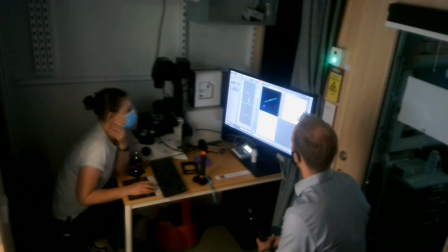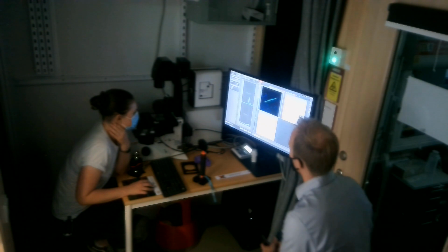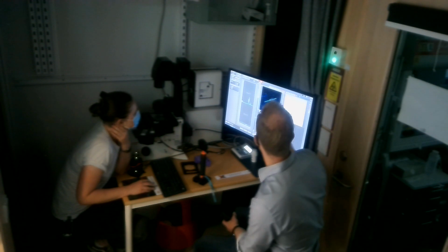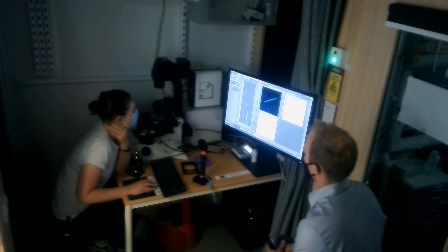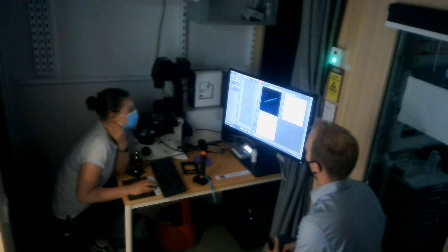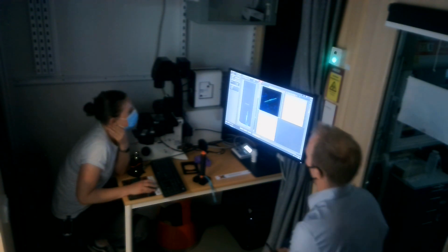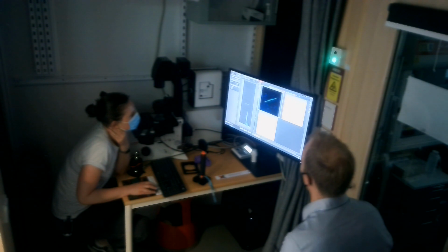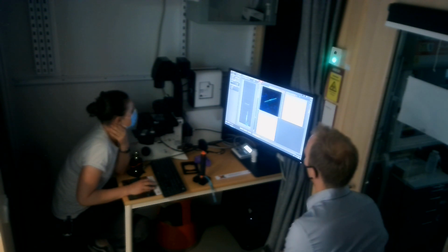Okay. And then you would have your channel 1 and channel 2 in there. You can also, I mean, this might not be so interesting, untick channel 2 if you just want to look at channel 1. What's a stack profile? That has to do with, if you do a set stack, then you can get information about how it looks throughout the stack and so on. I think it also works for time stacks. Sort of. Okay, nice.